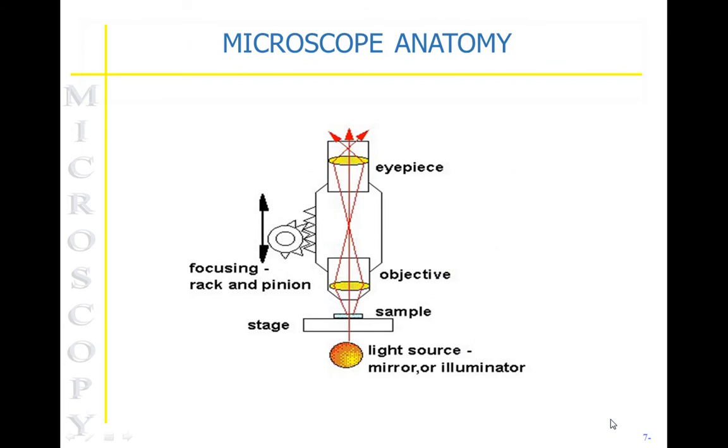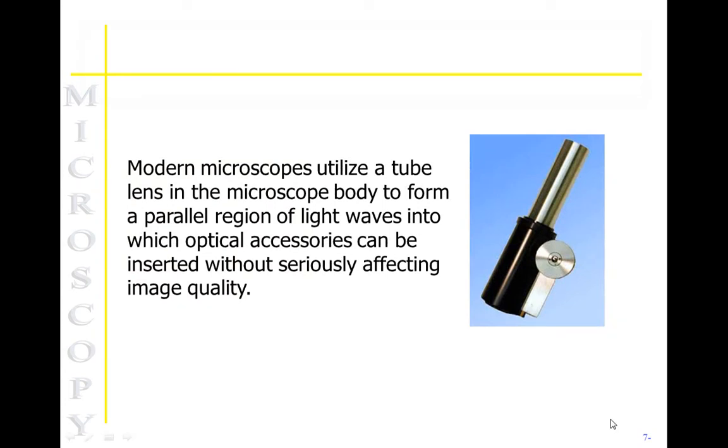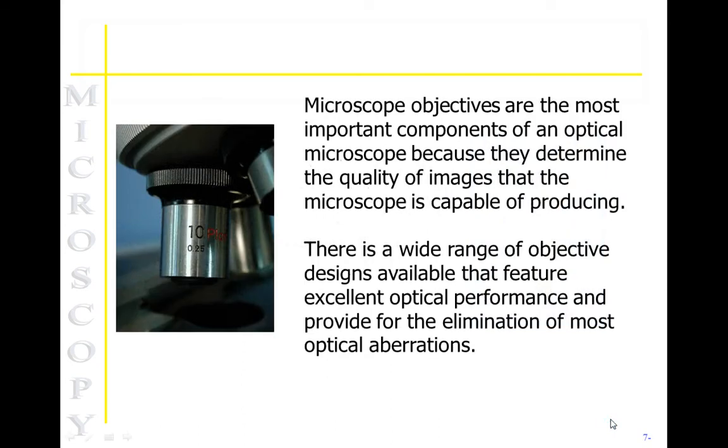The compound light microscope has a wide variety of different portions to the microscope itself. Starting at the top of the microscope, there are eyepieces or oculars that work in combination with the objectives to provide the total magnification of the microscope. This allows you to see the specimens clearly. The oculars are usually placed on a mechanical tube that allows the light to pass through to the objectives. The objectives are the second component that provides the magnification in addition with the oculars of the microscope.